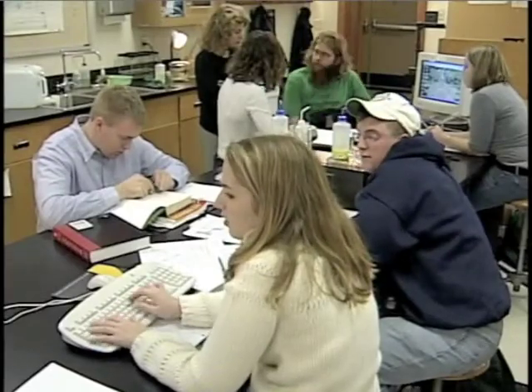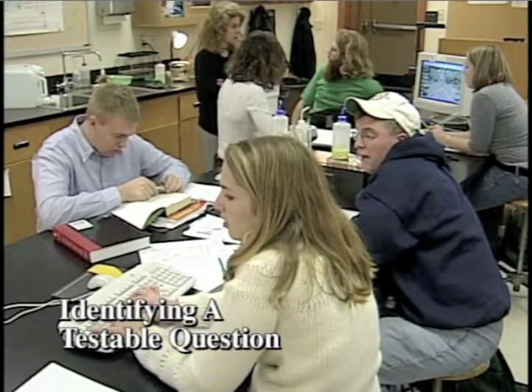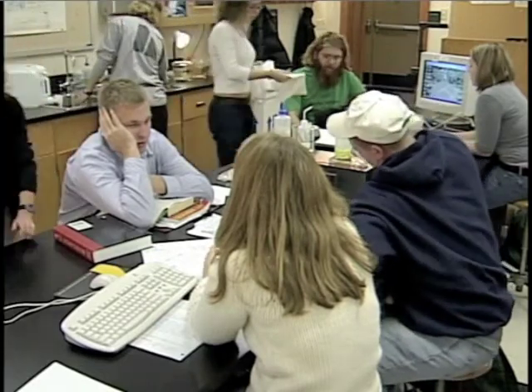Daphnia. I'm not sure if that is natural, you're trying to keep the females so they reproduce again. We can do a couple different food measurements also. You could line it with paper towel, put a little bit of paper towel on top as well, as a moisture source, like a preliminary experiment. Plastic bag, whatever. Just have one with hardly any, and a few, like 10.